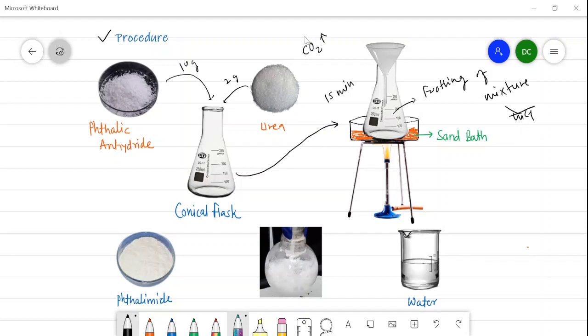After complete evolution of this CO2 gas from the reaction mixture, the foam-like compound which is formed in this conical flask becomes a solid one and it looks like this. So actually this type of product is obtained. First of all it is like a foam, then after complete evolution of CO2 we get a solid product.